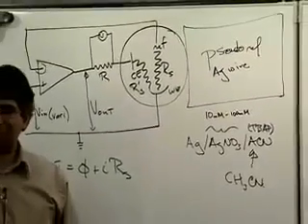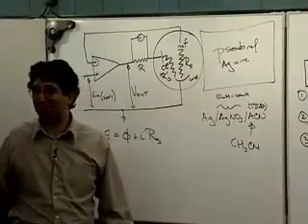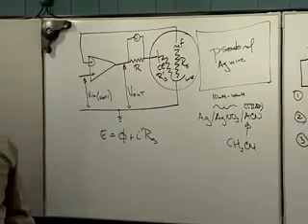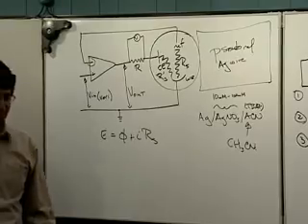Platinum tends to be electrocatalytic for a wide variety of couples. You're hoping there's some little bit of garbage, oxygen or something in your cell, water, a little bit of something that platinum would be catalytic for, and it'll just latch onto that potential, and for the short time you need it, it'll hold it.